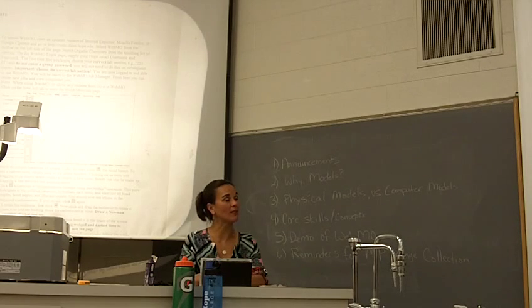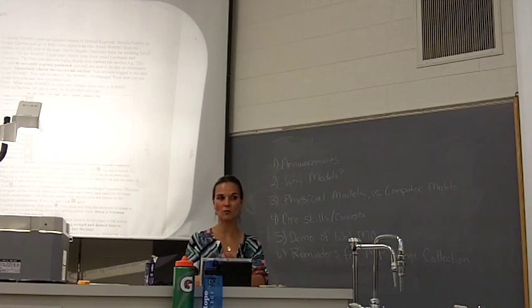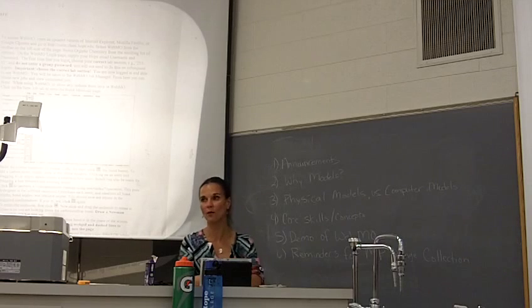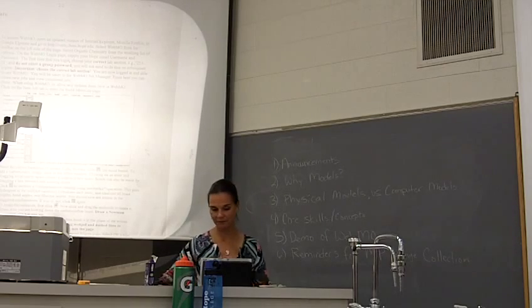Being that we now use it with WebMO, it is accessible anywhere you're connected to the campus server. So as long as you are logged into your computer on campus, you can connect to Curie, all right? So you can do this sitting on your bed at night, watching TV, or at 2 in the morning because you can't sleep, whenever you want to do this. You don't have to depend on getting the CD from the organic labs, okay?